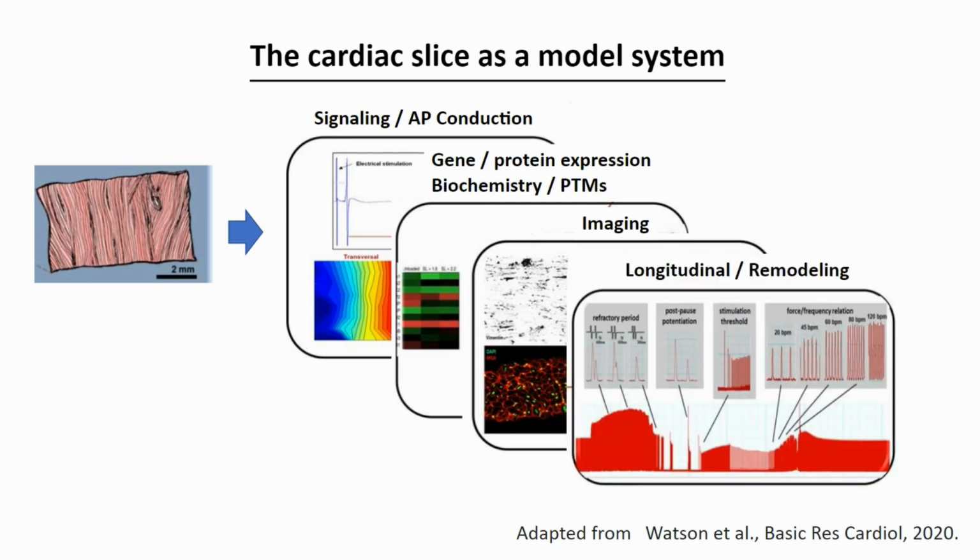And then finally, long-term incubation is an important use of the cardiac slice. There are some laboratories that have been able to maintain functionally viable cardiac slices for weeks and even months, which allows for examination of cardiac remodeling, for example. For the remainder of this webinar, however, we will not be discussing these 4 applications listed here on this slide, but if you're interested in references for these applications, you can look at the Resources tab, and you should find some helpful references there.